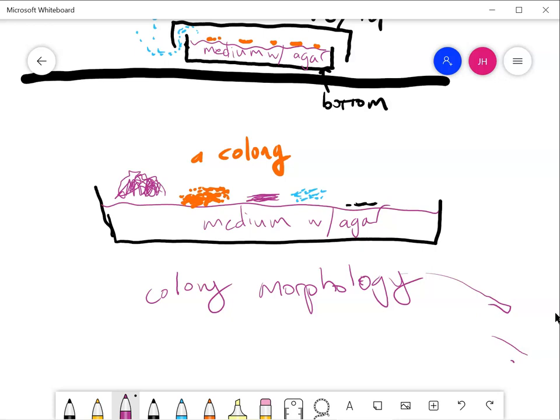So we can see them, we can tell what shape they are, but that's really about all we can do. But a bacterial colony could have a lot of different characteristics. It could be shiny, it could be rough, it could be a dome shape, it could be flat, it could be orange or purple. And all those different things kind of tell you what sorts of cells you're working with.